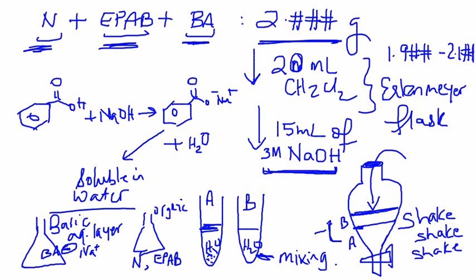You have to do this twice. The reason you're doing it twice is because you want to ensure that you have extracted out benzoic acid completely.